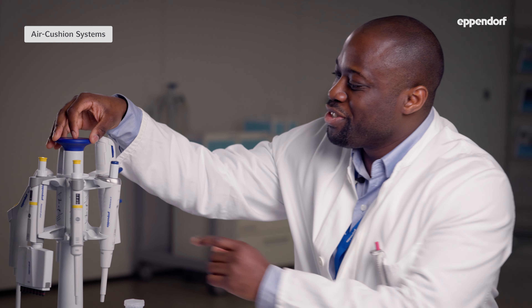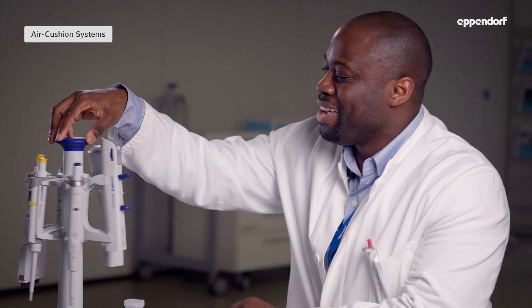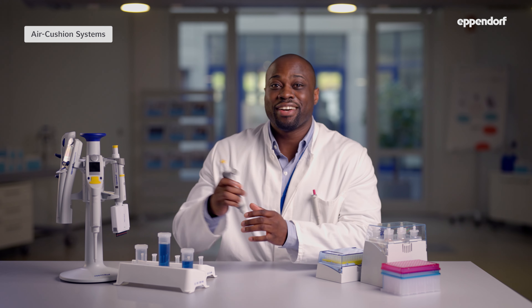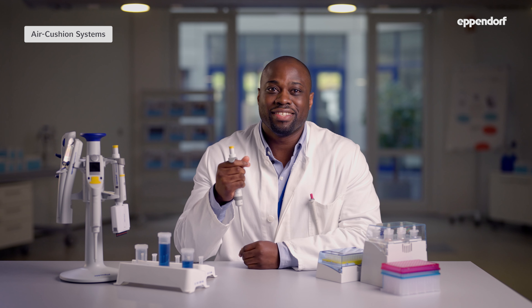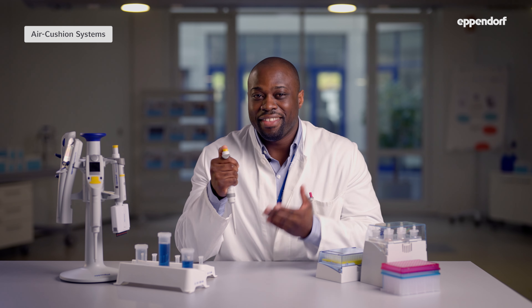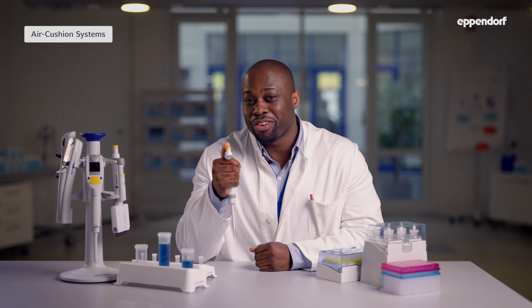Here at Eppendorf, our air cushion pipettes include the Research Plus, the Reference 2, and the Explorer electronic pipette. As you may have guessed from its name, this air cushion pipette has a specific amount of air inside. When you push down the control button, a piston pushes part of the air out of the pipette and creates a vacuum in the attached tip. When you release the control button, this vacuum fills up with liquid.